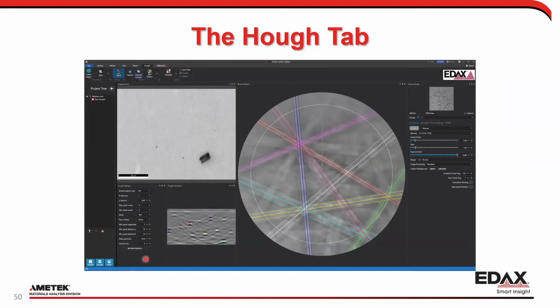The other thing that I often change down here is the vertical bias. I usually have this around 3 degrees. This is actually a perfect example. The vertical bias right now is at 0. If I change to 3, see this Hough band down here right on the edge, and maybe it's not the best, maybe there's an artifact. With a vertical bias of 3, it's going to say, let's go a little bit higher and find a new line. It's going to probably find this one instead. So it just gets me away from any artifacts I would have on the bottom of the actual Hough itself.